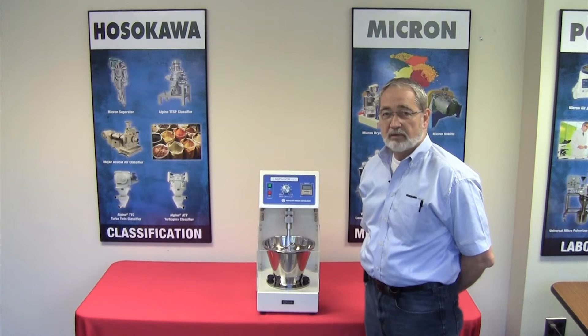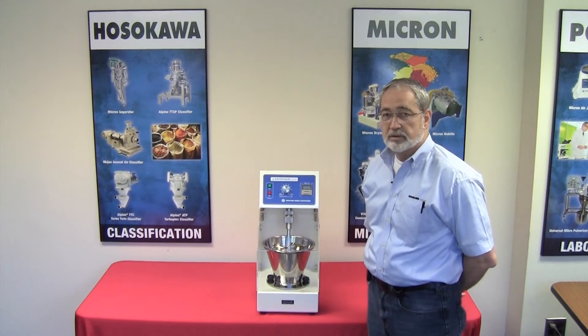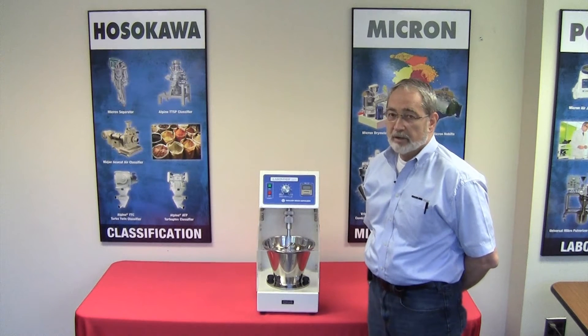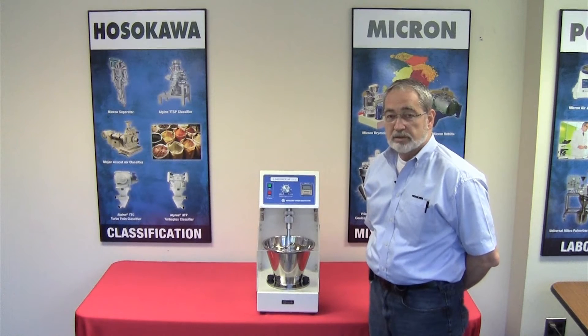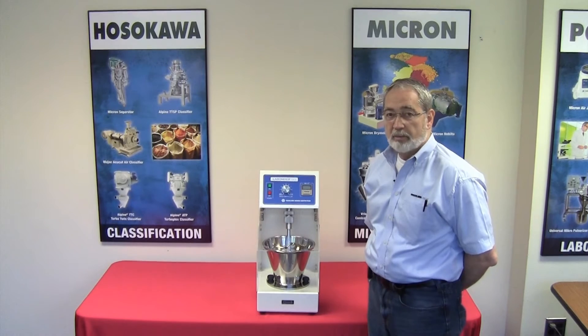Hello, my name is Tim Calvo. I'm with Hosokawa Micron Powder Systems in Summit, New Jersey. Today we're going to talk about the Hosokawa Micron Labomixer model LV-1, which is designed for tabletop laboratory small batch mixing of dry product.